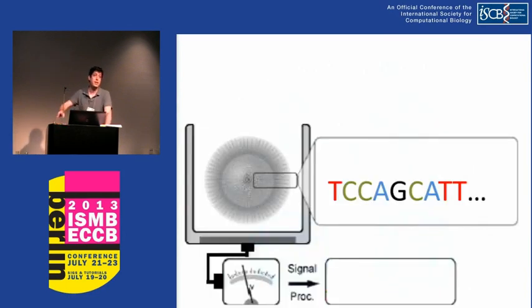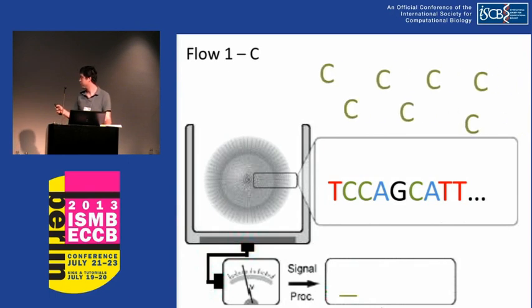At this step, you pour your beads onto the chip. The chip contains many wells. So this is one well with one bead and many copies of one template. So this is the template. And is this the pointer? No, on top. Oh, yeah, I got it. Thanks. Okay, so this is the bead, this is the well, this is the template.